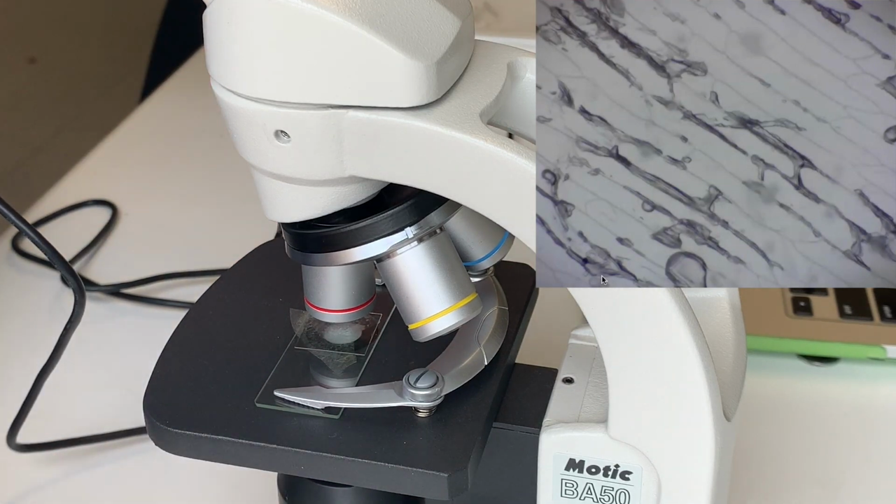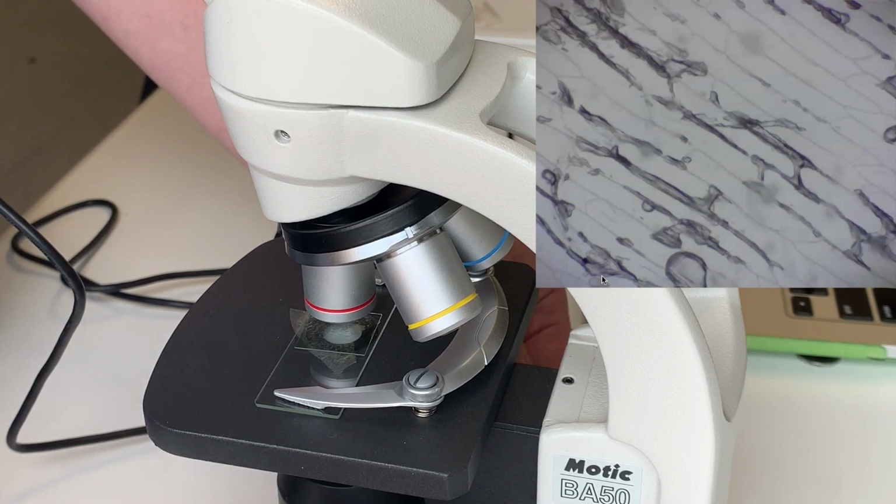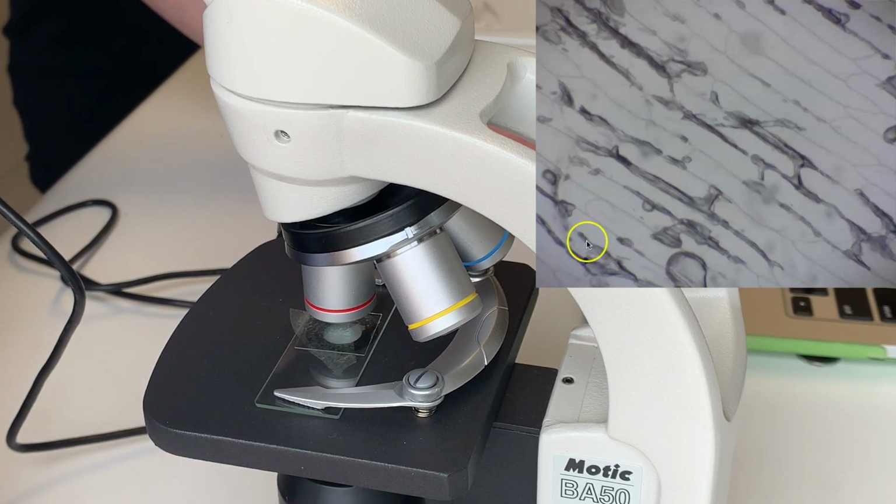Once you've got an image you want to look at, you want to use the fine focus and try and make that a clearer image. So as you can see over here, we can start to see the borders of the cell. There's not much else we can see besides the cell membrane, cell wall. That's about all we can see in the onion slide with a light microscope. We could have seen more with the electron microscope a few weeks ago.